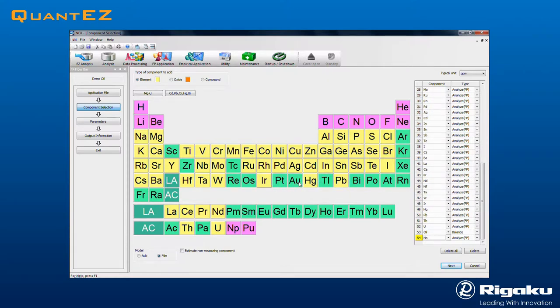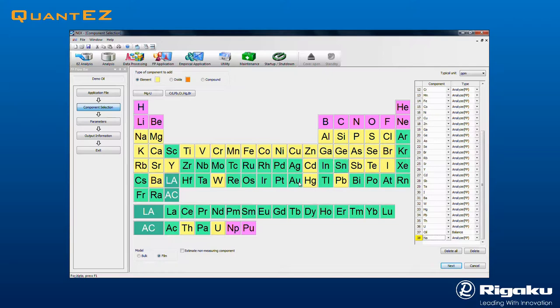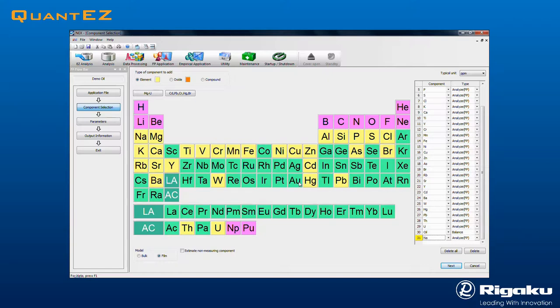Green elements, like sodium, could be measured as well. Purple components are not directly measurable. Simply deselect components that are known not to be present. Notice that the template automatically selects Oil as the Balance component.